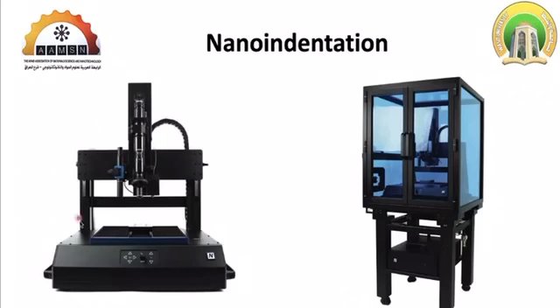Nanoindentation is a compact, tabletop, small machine, and its configuration is quite similar to hardness testing. We force an indenter with different shapes to penetrate the surface and then leave the surface.